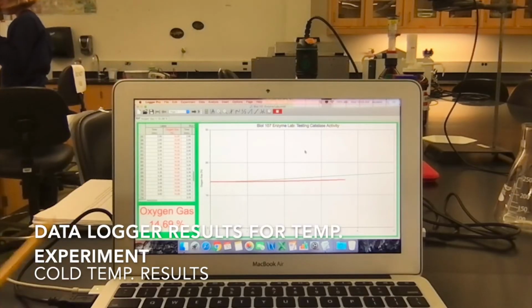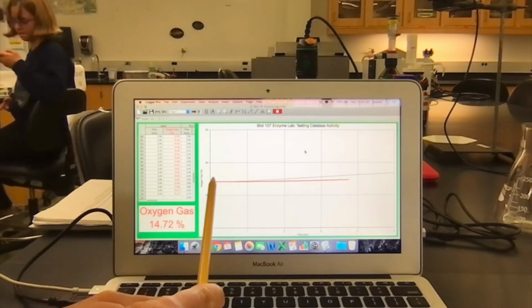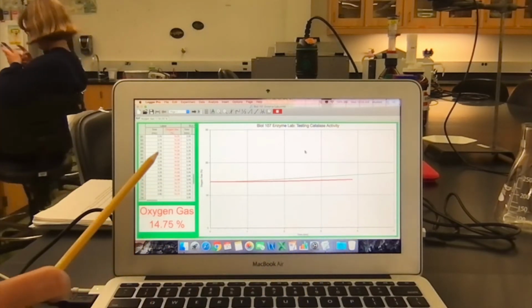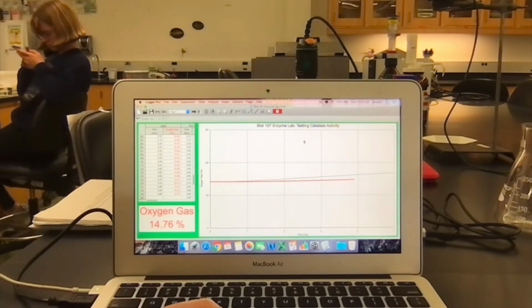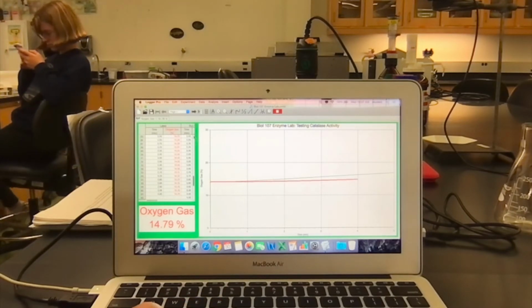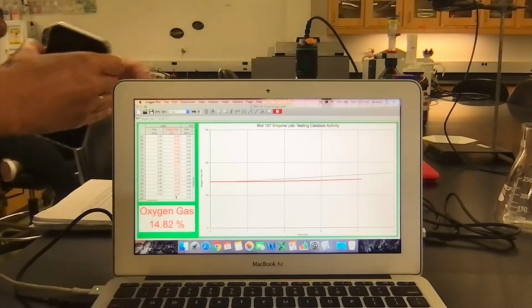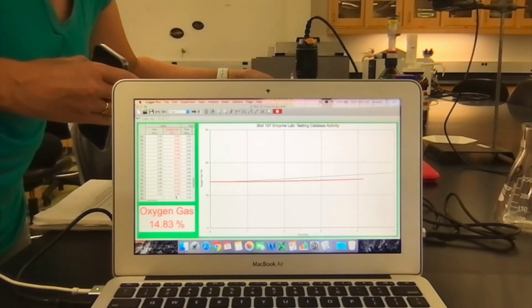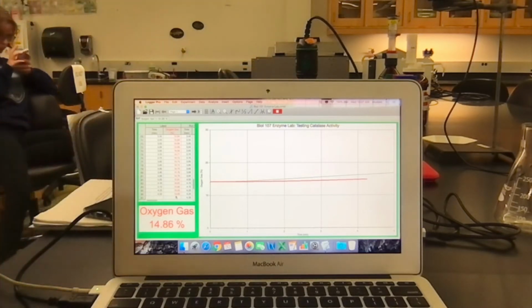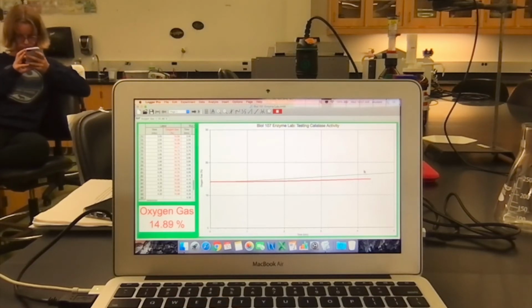Okay, so now I'm looking at the results. This is for the cold water that's in red, or the cold temperature. This red line is cold. The green line above it was the room temperature. You can see, if you look carefully, that it started somewhere up here. It's probably about 14. That seems to be our general starting value, 14 something. And we're only to 14.81, and the temperature in our little bucket is still only about 3 degrees now. So not going nearly as quickly, not as much oxygen produced as at room temperature.